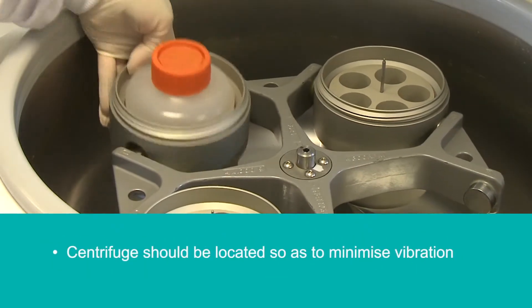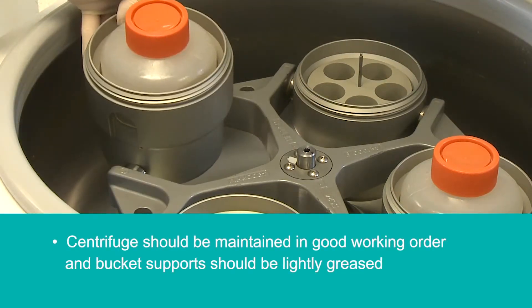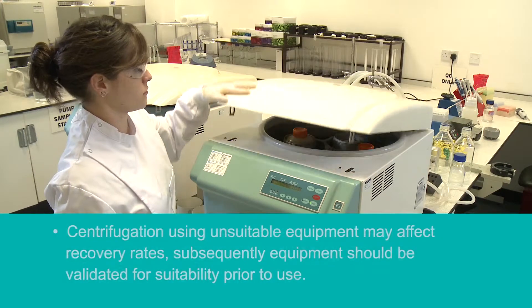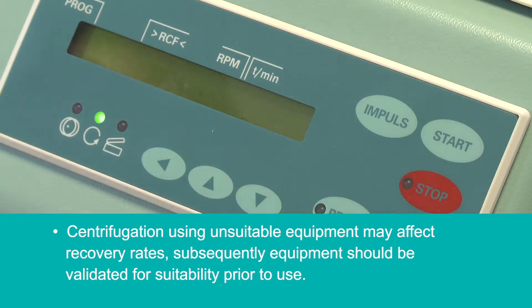The centrifuge should be located so as to minimise vibration and maintained in good working order; bucket supports should be lightly greased. Centrifugation using unsuitable equipment may affect recovery rates, so equipment should be validated for suitability prior to use.